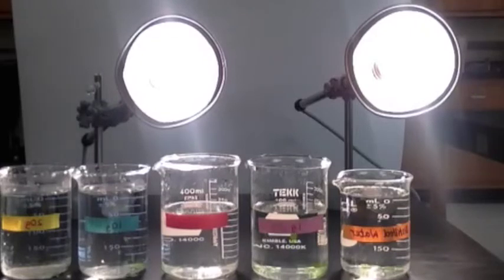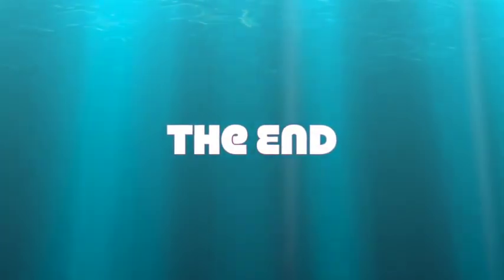Sources of error include droplets of solution spilled while removing gas from the leaves using syringes, the slightly wilted condition of the spinach leaves, and small differences in the position of the light source. This experiment could have been improved if all the spinach leaves were in healthy condition and the observation was extended over a longer period of time. This was our experiment, and have a good day.